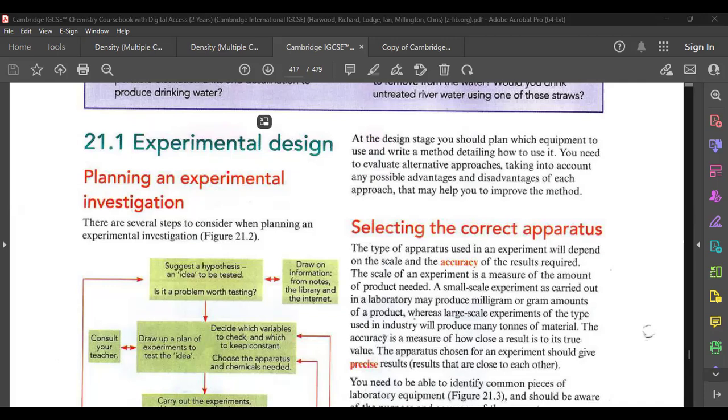Reaction through two ways, and also we will get to know how to collect gases based on their atomic weights or molecular masses. So first of all, how do we measure time? We obviously use a clock in our daily life, and that's how we measure time in the lab as well.